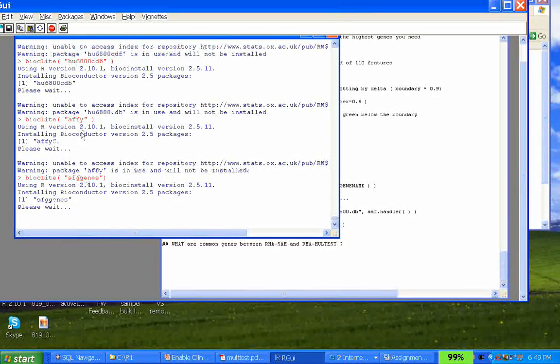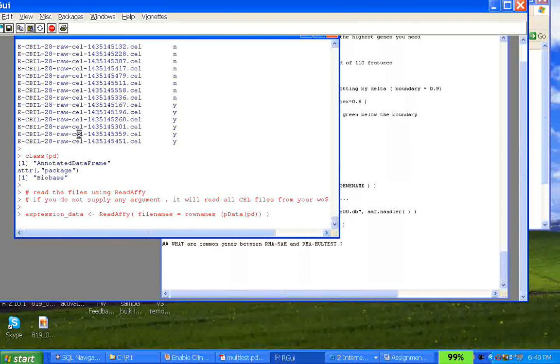But anyway, this is how things get imported, right? Good to see it. I copied too much. I'm going to close out of this session maybe. Sorry guys.